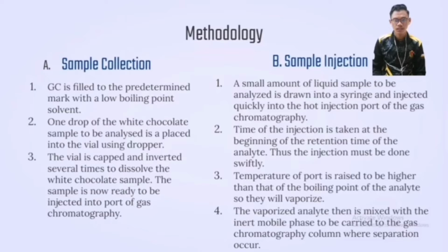For sample injection, a small amount of liquid sample to be analyzed is drawn into a syringe and injected quickly into the hot injection port of the gas chromatography. The time of the injection is taken as the beginning of the retention time of the analyte. Thus, the injection must be done swiftly.